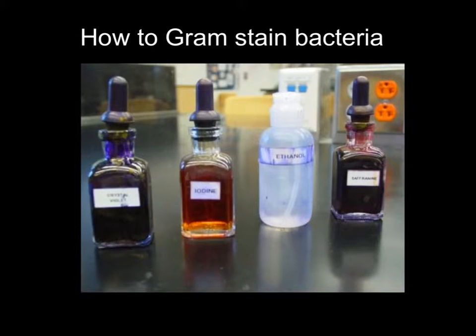This video will cover how to gram stain bacteria. The gram stain is the most important staining procedure in microbiology. It is used to differentiate between gram-positive organisms and gram-negative organisms. Hence, it is a differential stain.